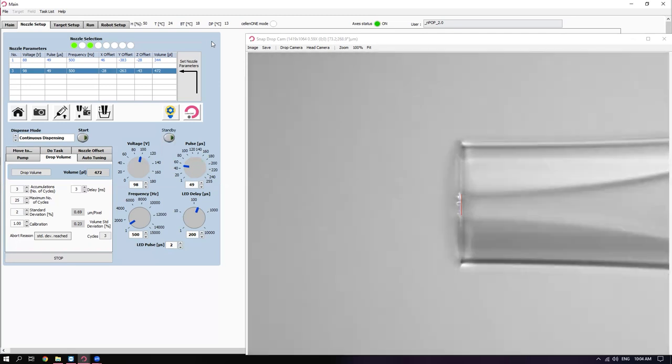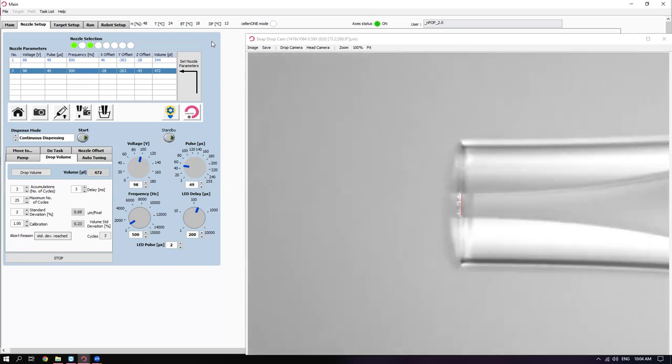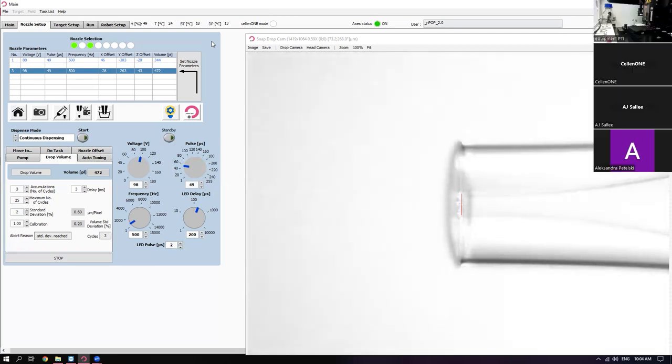We have two positions here on the deck. I don't know if you can see it when you're sitting down, and I don't think we have the video of the inside up, but each of these positions can hold a 96-well plate, a slide, or the proteo chips for label-free, and the programming is entirely flexible.